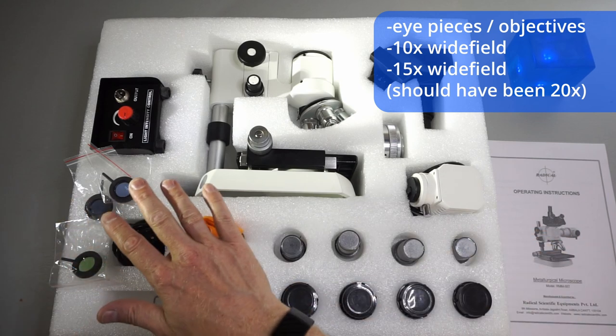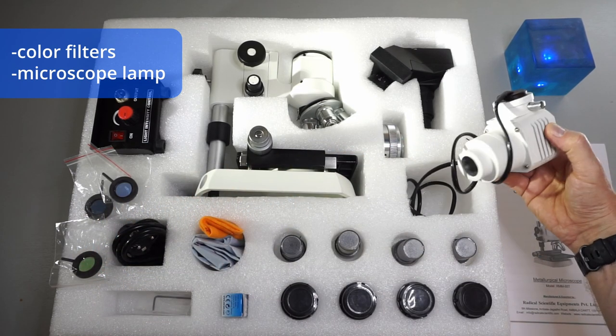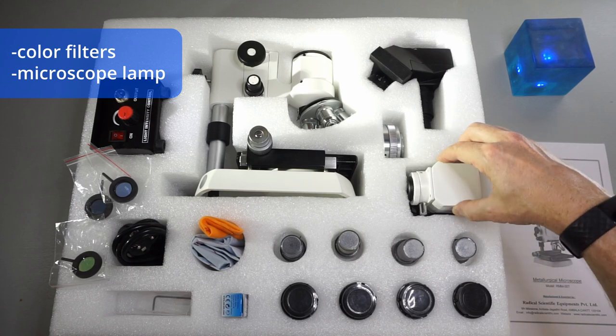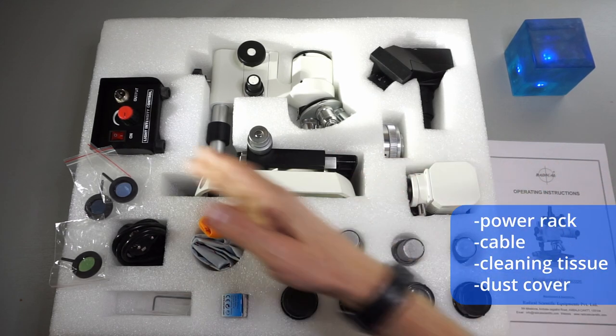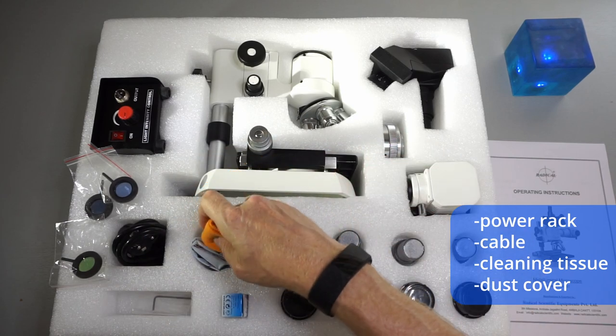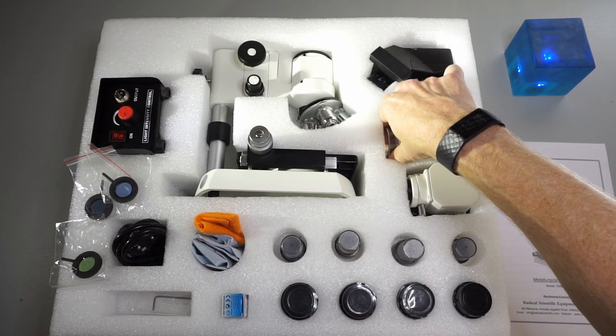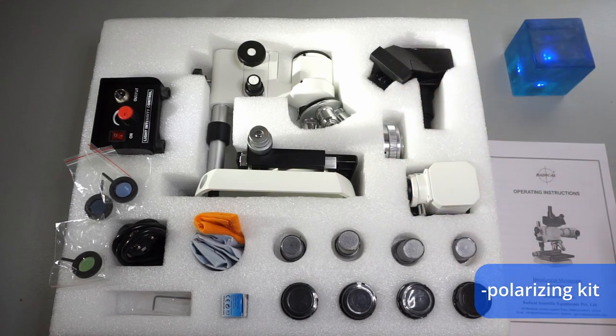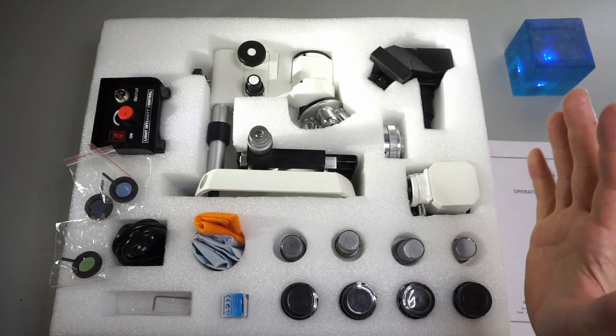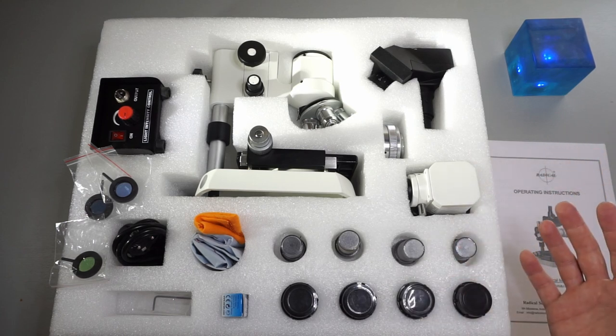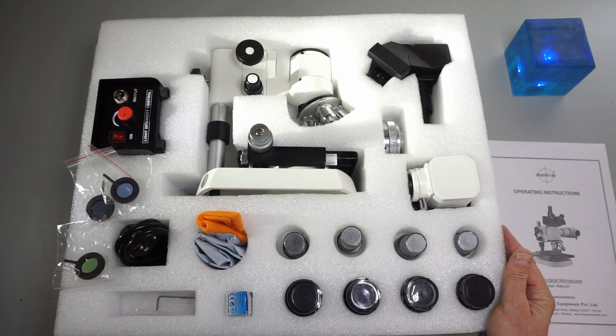There are some specific blue and green filters which we can use together with this lamp, which is a typical feature of a metallurgy microscope. We have the power pack, the cable, a tissue, there's a dust cover, and a polarizing kit which is this part. So everything's there, I'm super happy. The whole thing cost less than 400 euro plus importing tax. Shipment was paid by Radical, so yeah, so far so good.